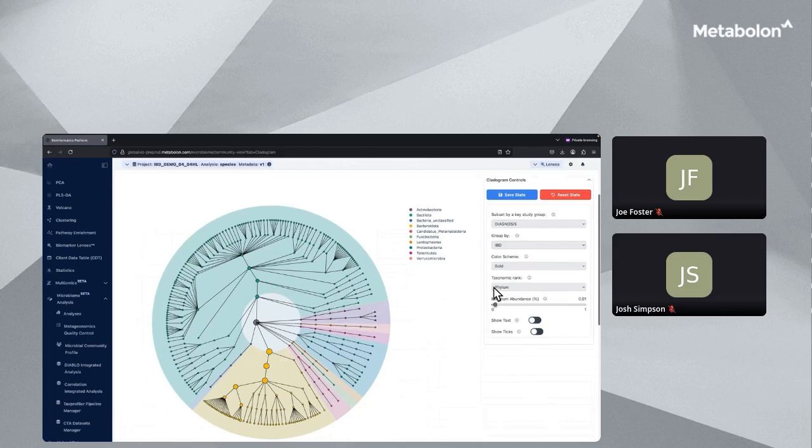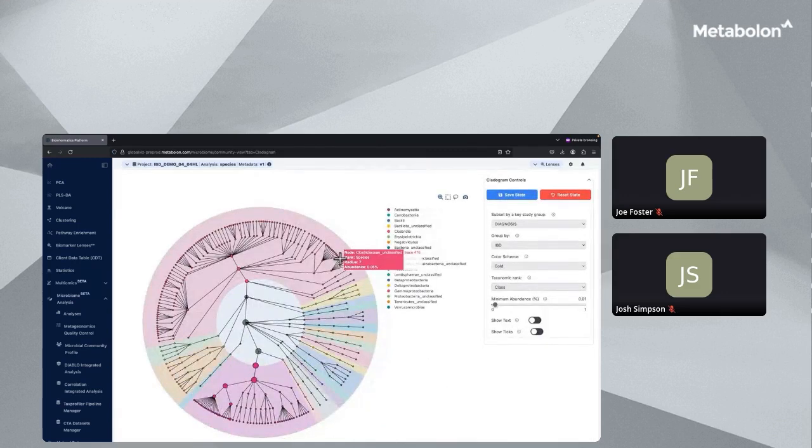In this example of the IBD group, we can clearly see that at the phylum level, the abundance of Firmicutes in green is markedly less than that of the Bacteroidetes in yellow. These differences become even more apparent when we customize the plot to color bacteria beginning at the class rank. These results suggest that the Bacteroides in the IBD group are the primary contributor to the low Gini index that we observed back in alpha diversity.